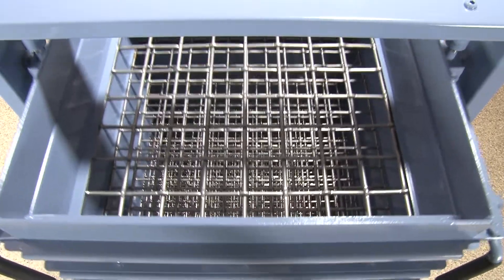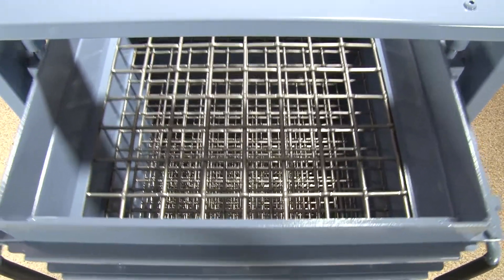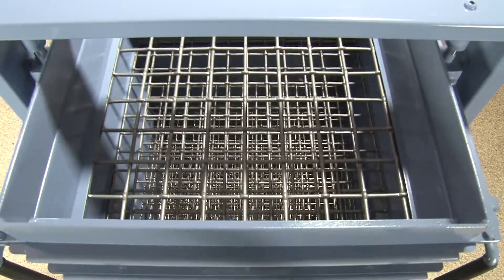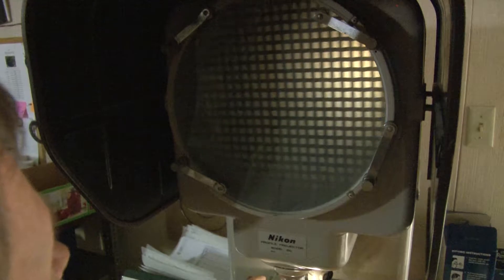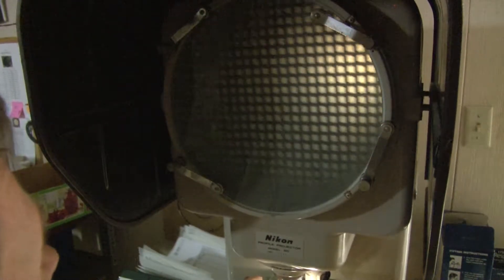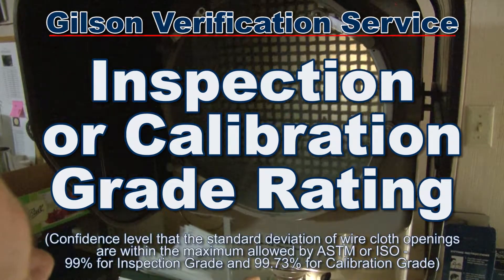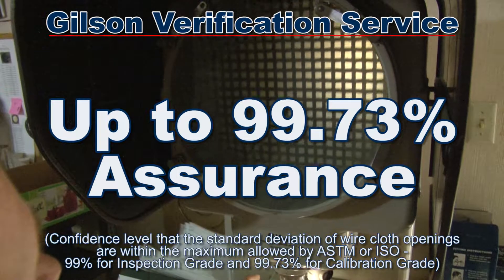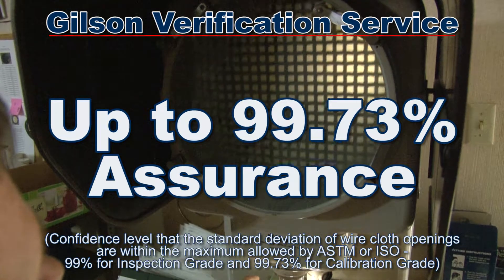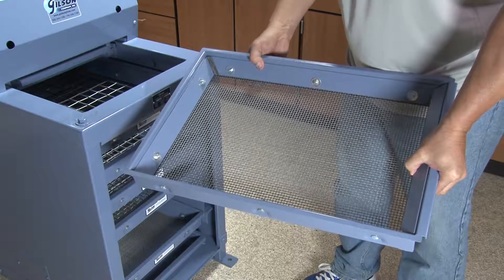When you need to assure that your screen tray meets ASTM or ISO requirements for opening sizes, Gilson's verification service on new compliance grade screen trays can produce an ASTM or ISO inspection or calibration grade rating with up to 99.73% statistical assurance that your screen tray meets ASTM or ISO standards.